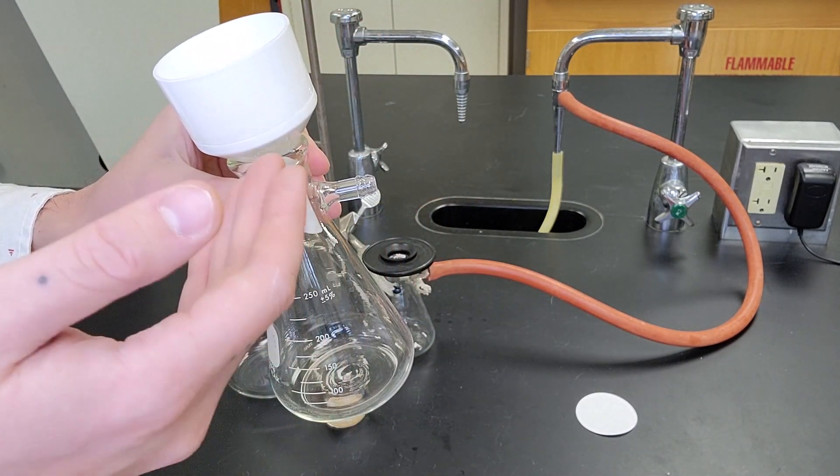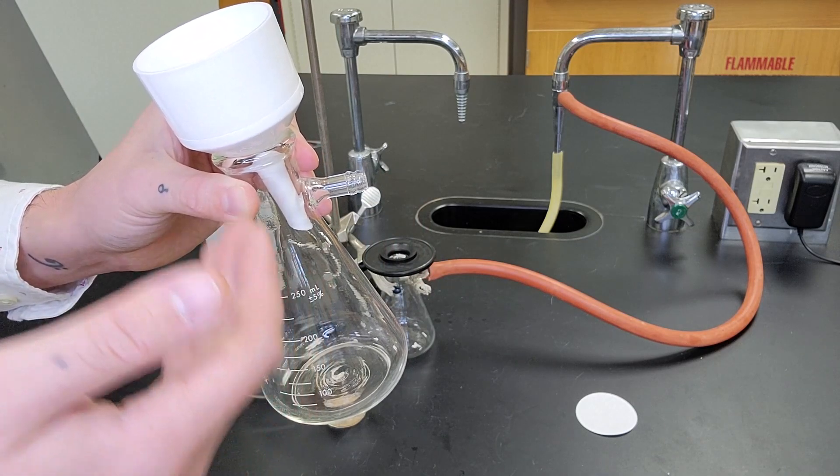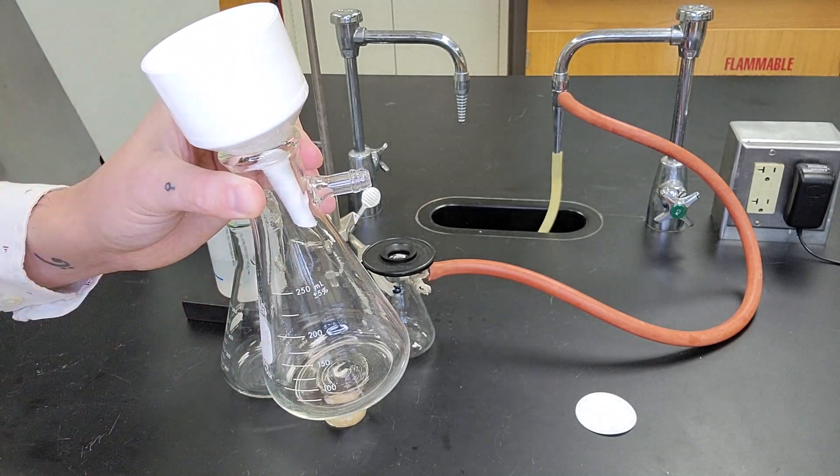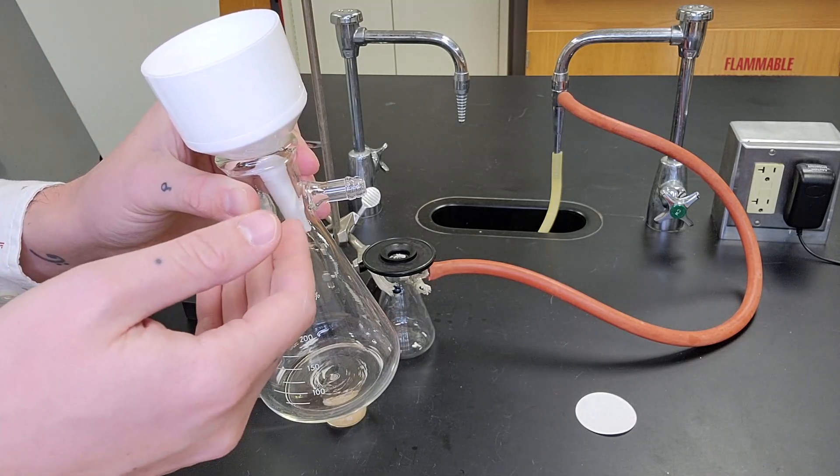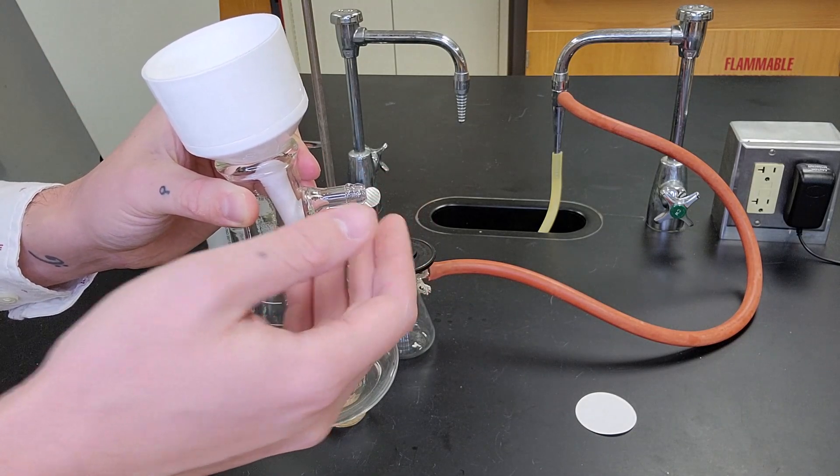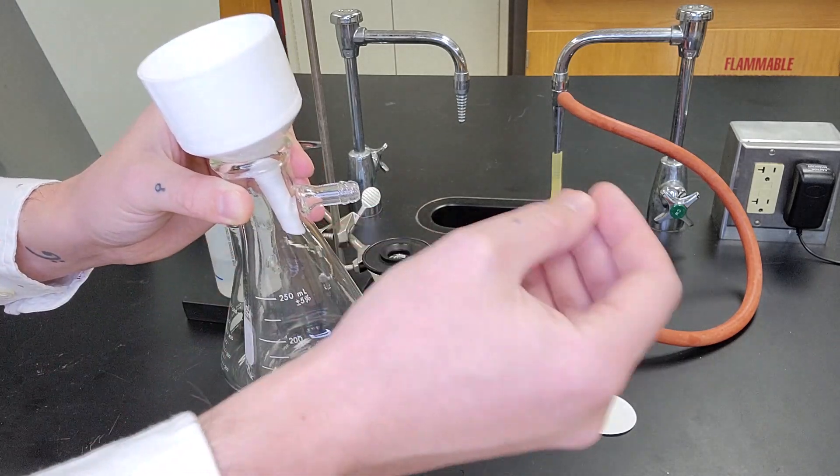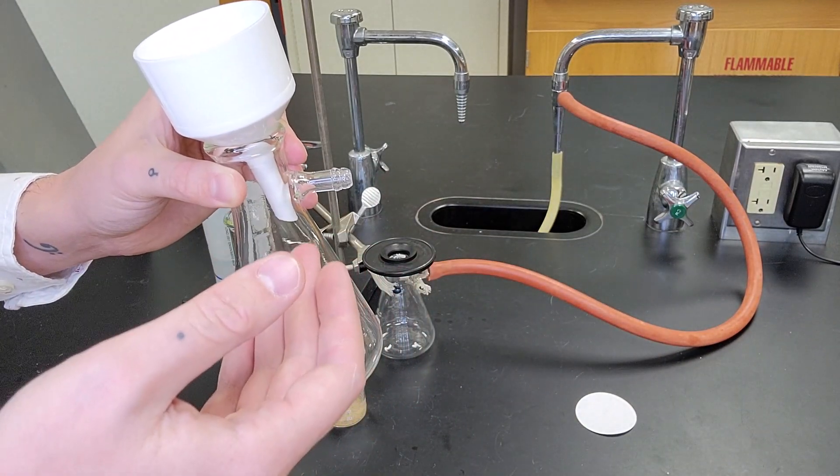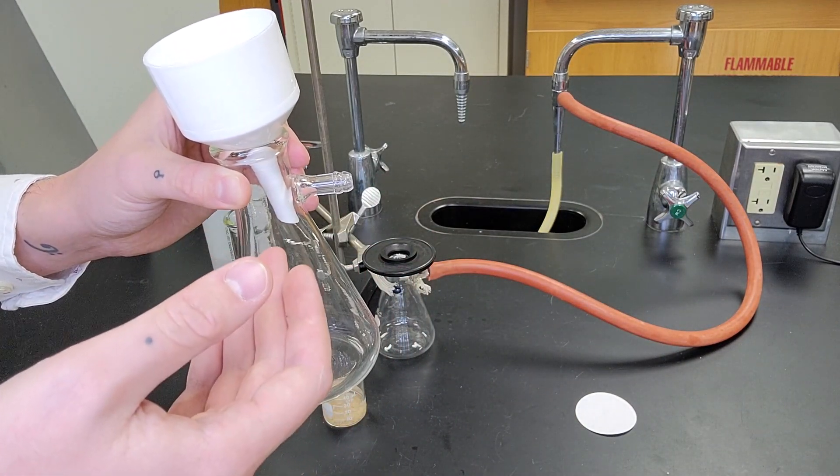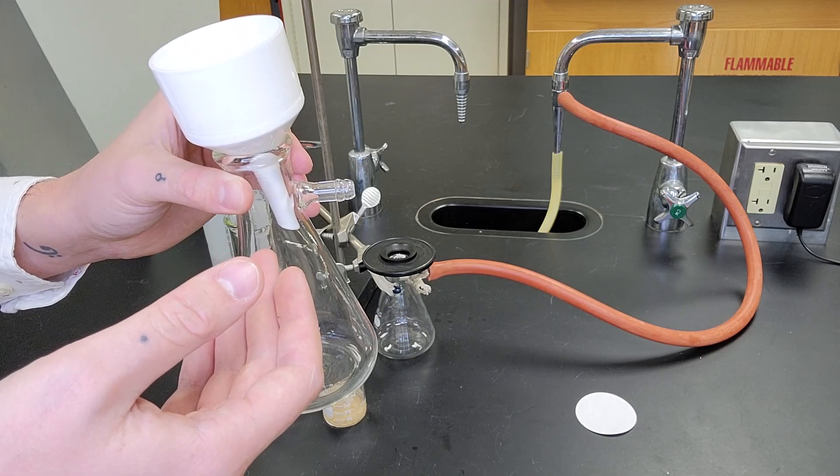This is less important in an organic chemistry lab and more important in labs where you're using a higher power vacuum. If you have the opening facing the sidearm, you run the risk of sucking the liquid right out as it comes through into the vacuum. For expensive vacuum pumps, this can be a big hazard and a very expensive mistake.